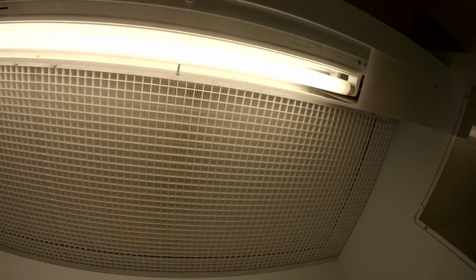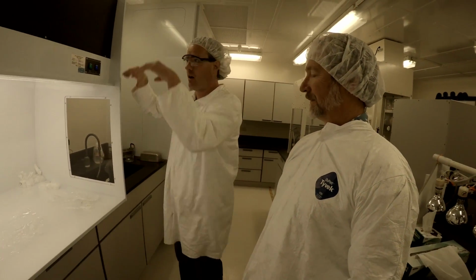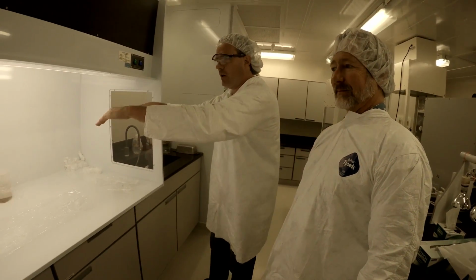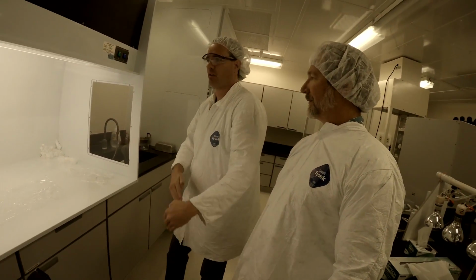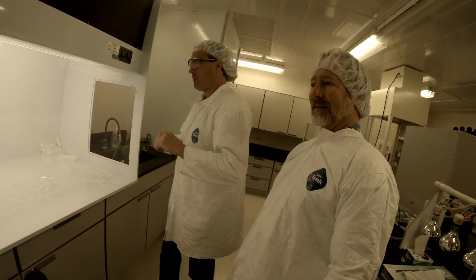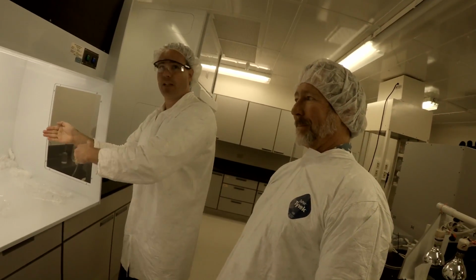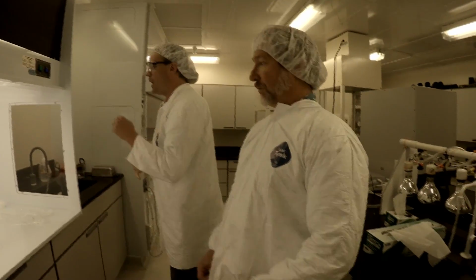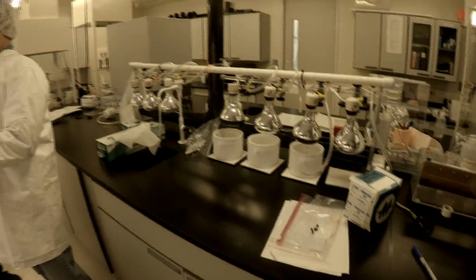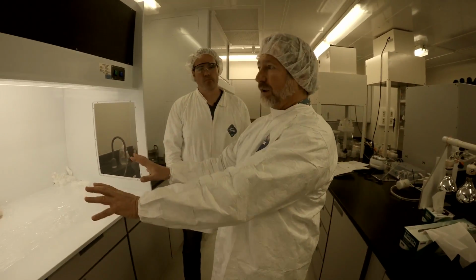And above it are 3 fans pushing air from the top of the lab, where it's clean and not dusty, through the filter into the hood, and it then comes over the surface of the hood and onto the ground. So again, the farther in you go, the cleaner it gets. The back of the hoods are cleaner than the fronts of the hoods, which are cleaner than the air in the labs.